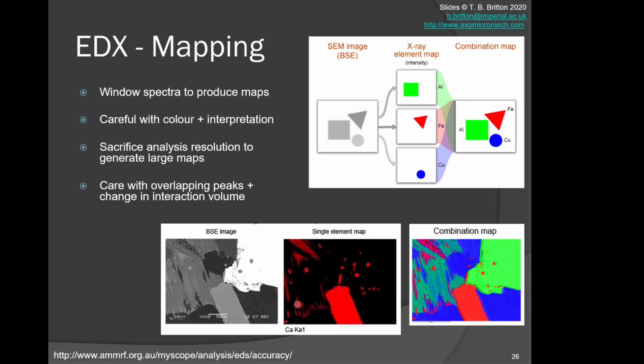Once you have an idea roughly what elements might be present, maybe not the quant per se, but you've created some spectra, you can move the beam across your sample and map the various chemical compositions. A relatively easy method to do this, and we've seen this in the SEM course, is to effectively, at each point, gate the energy associated with particular excitations, and then we can correlate those with particular speciations. So we can see there's an aluminium-rich region, an iron-rich region, and a copper-rich region.